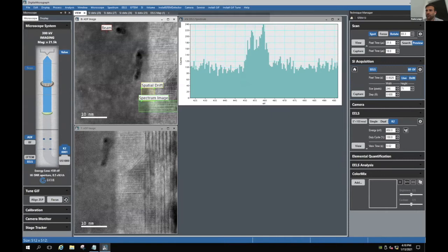Oh, radial distribution. Okay, that's a different thing. What they mean by that is they want to do extended fine structure and then model the modulations off the backside of it, like you would do a radial distribution function in X-ray, or in synchrotron data, right? Okay, upcoming events. Okay, can you comment on performing EELS experiment?